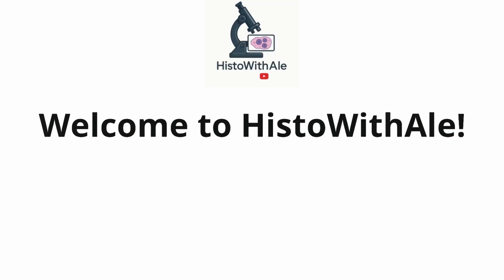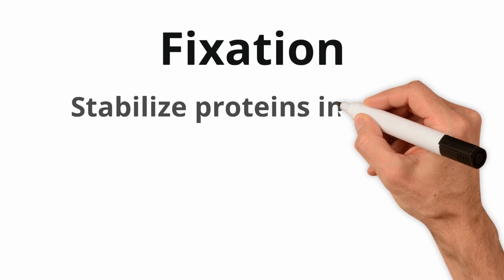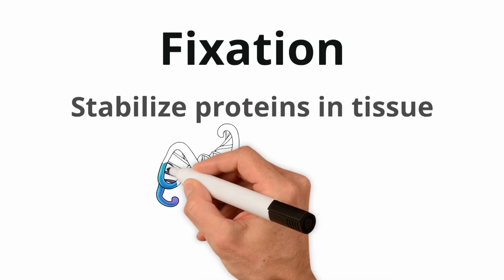Today we're gonna talk about the very first and arguably the most important step in tissue processing, fixation. Fixation works by stabilizing proteins in tissue, making them resistant to further change.